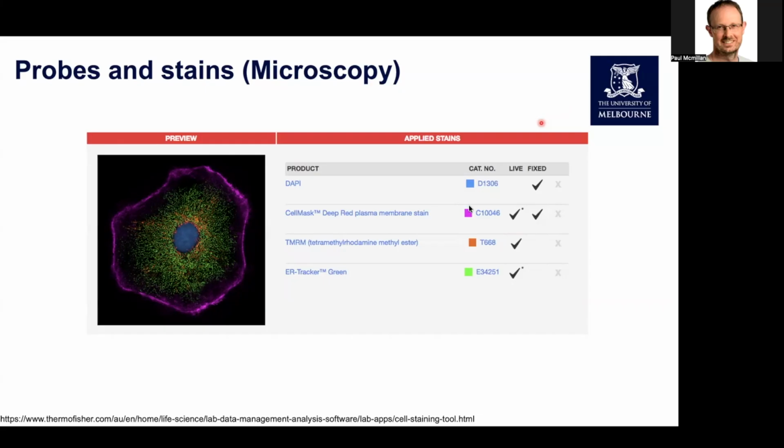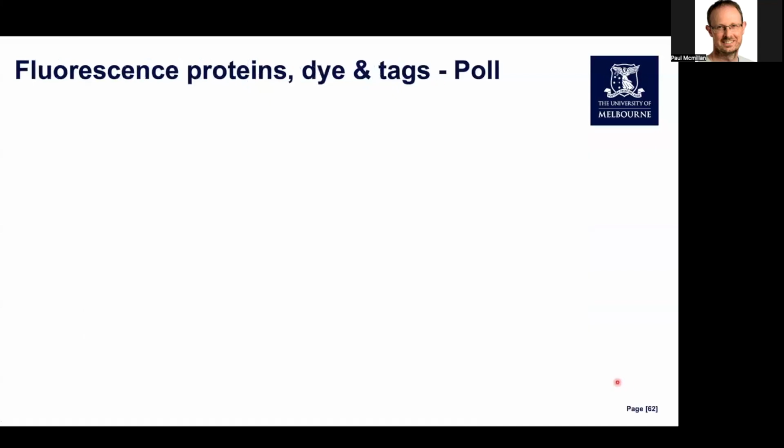sometimes they are compatible just with live cell or just with fixed. Sometimes they are compatible with both live cell and fixed applications. And again, something to be aware of when you first start those experiments, when you're in the experimental planning stage. All right, so that's the end of that section.